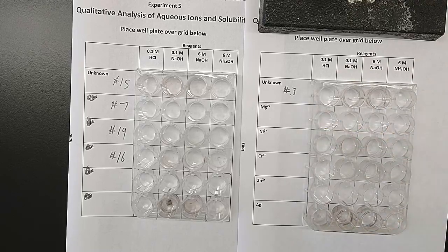If we had absolutely no idea what our unknown was, the experiment would be a little bit more challenging, but still doable via old school methods. New school methods are instrumental and more technologically based. Just run the thing through a GC mass spec or an atomic absorption spectrometer, and you can determine the identity of unknowns that way. But this is old school qualitative matching. We're not determining how much is present. We are only determining what is present.